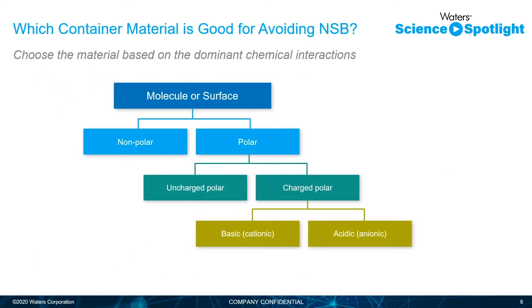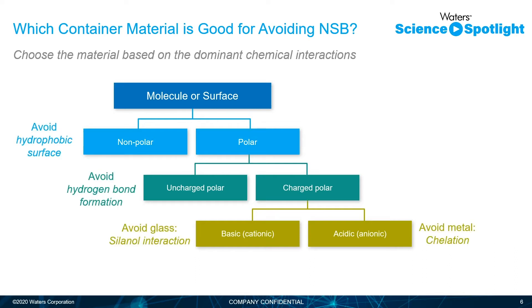One thing you can do to avoid nonspecific binding is to make a thoughtful, informed choice of sample container based on the dominant chemical interactions you want to avoid. If you have a nonpolar analyte, you want to avoid a container with a hydrophobic surface. If you have a polar analyte, consider whether it's uncharged — in which case avoid hydrogen bond formation — or charged. If it's basic, avoid glass due to silanol interactions. If it's acidic, you may need to avoid metal, which can cause chelation interactions.